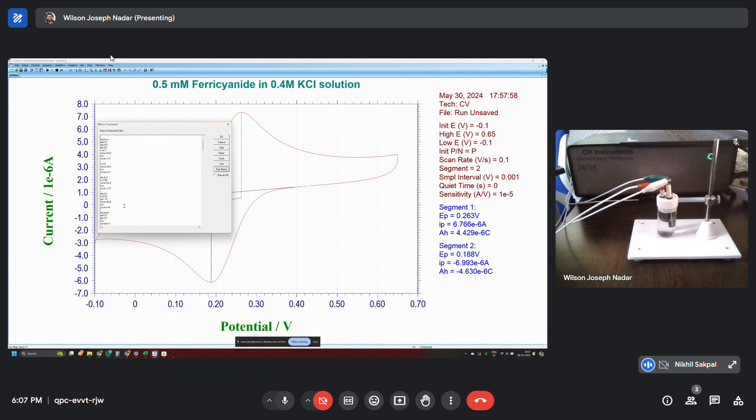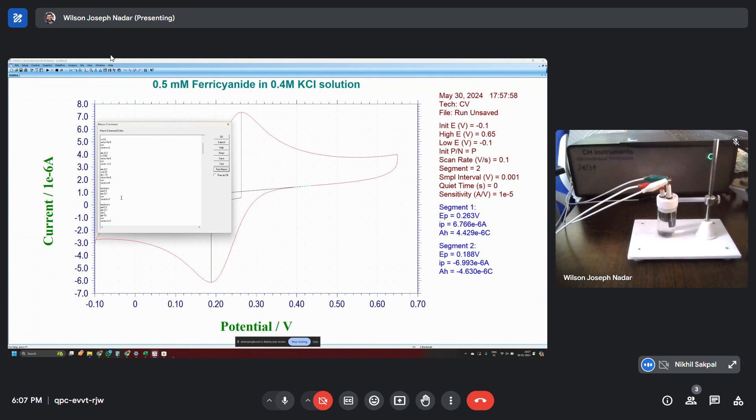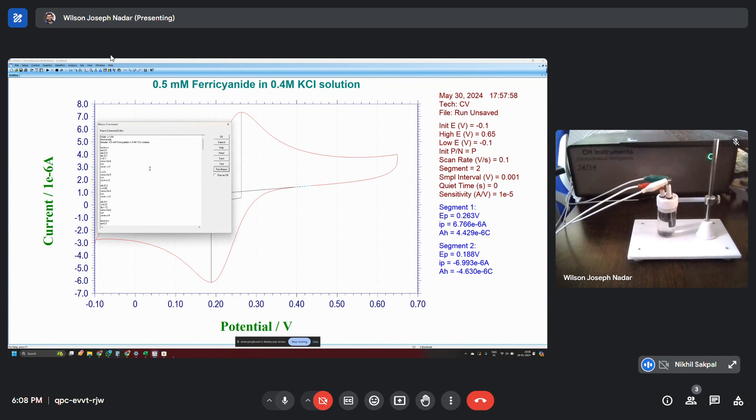So this is a very long defined experiment. I will simply run so that you can see one after the other things are being happening. So I have already defined. If you have any errors then you try to run the macro, it will prompt you with some error in the syntax. If there is no errors, it will simply run the program.